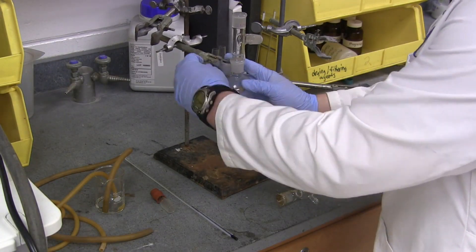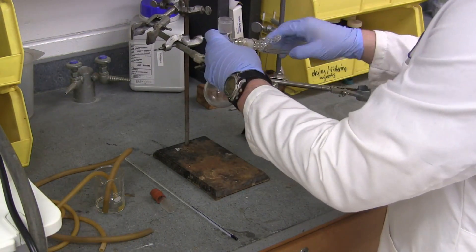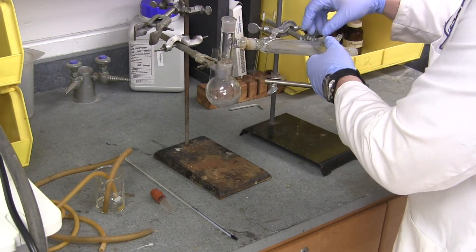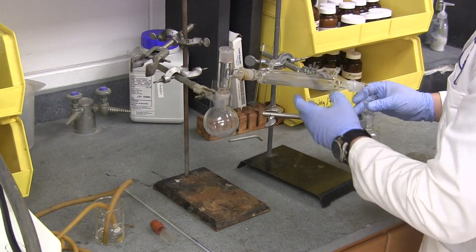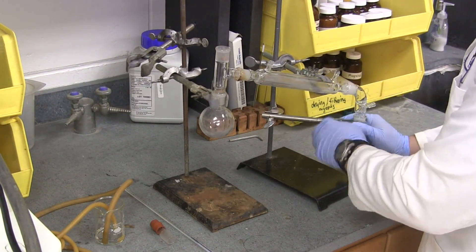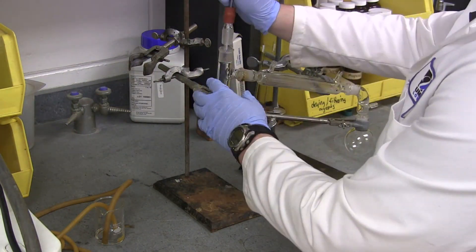For a simple distillation, the distilling flask is connected to a distillation head, which connects to a condenser which leads to a vacuum adapter and the receiving flask. There is also a thermometer adapter connected to the distillation head.